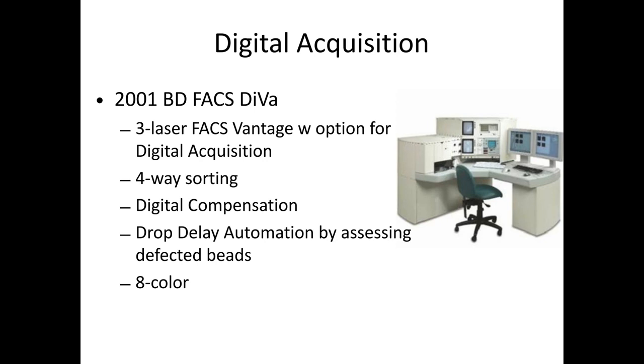And so finally, once the education spread, and I was giving lots of talks on digital versus analog to explain it to people and explain the new biexponential displays and stuff like that, people caught on.